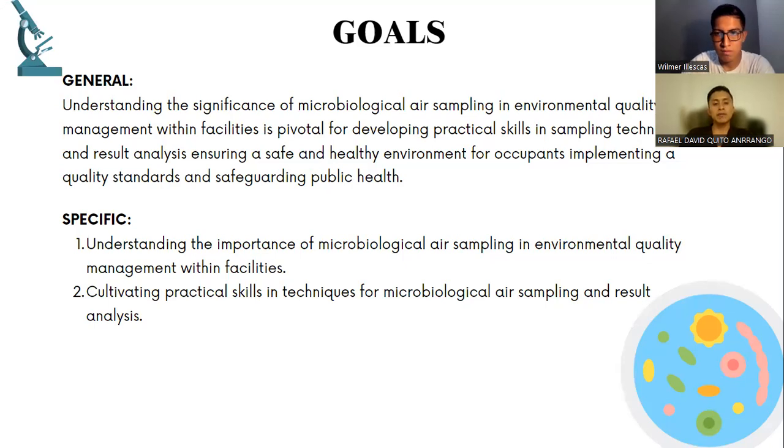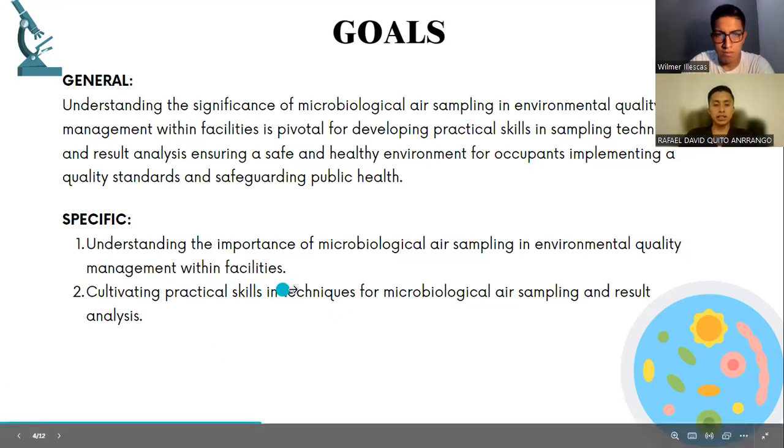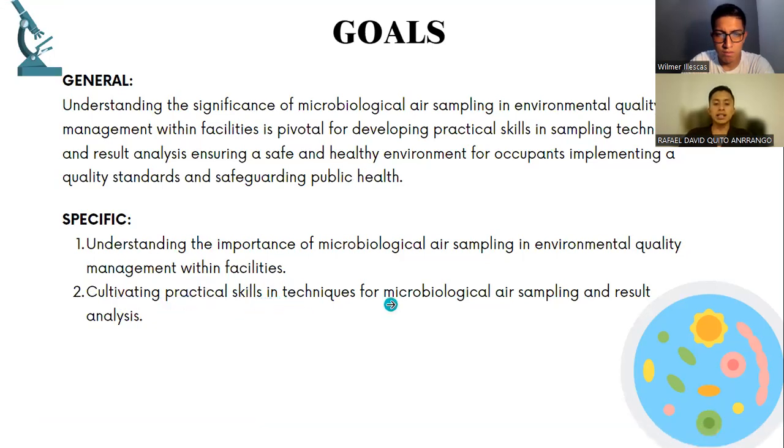The specific goal is understanding the importance of microbiological air sampling in environmental quality management within facilities, and cultivating practical skills in techniques for microbiological air sampling and results analysis.